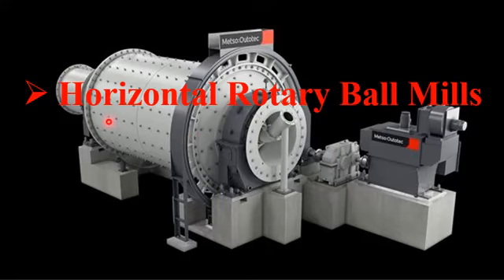In simple words, it rotates around the horizontal axis and is partially filled with the material to be ground plus the grinding medium. It is partially filled with the bulk material which we want to convert into nanoparticles, and also with balls, which are used as a crushing material to crush the bulk material.